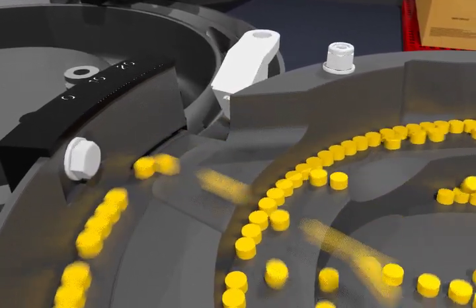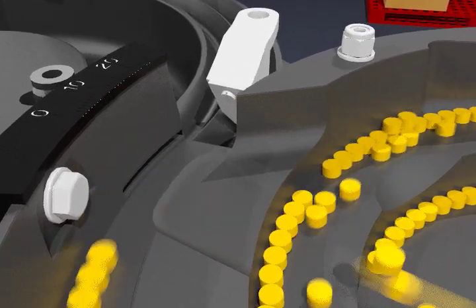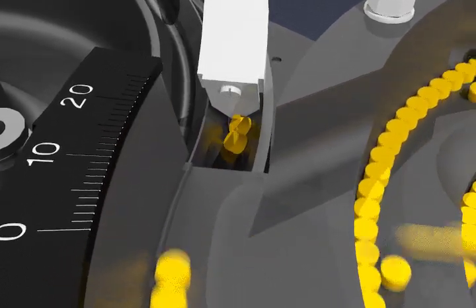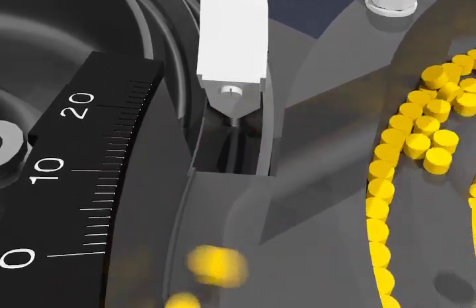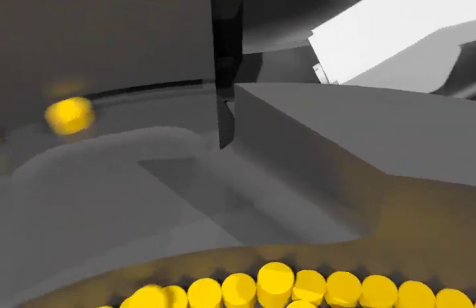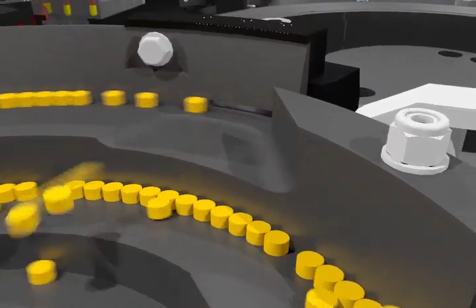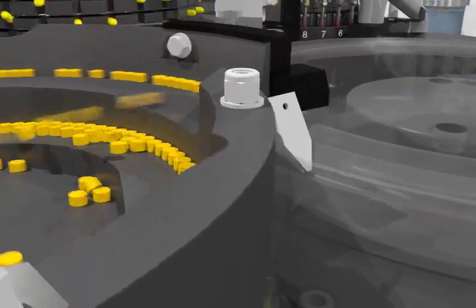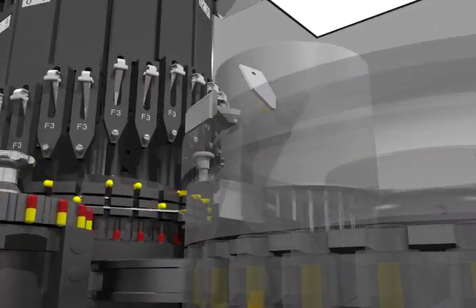As the feed drum rotates under the vibrating container tablet exit, the recirculation blower is stopped briefly to permit one or more tablets to be deposited into the continuous channel in preparation for dosing. Upon transfer of the preset number of tablets to the drum, the optically controlled blower resumes tablet recirculation. The tablet deposited into the channel is held in place by a blade as the feed drum rotates. The tablet then drops by gravity along the tablet chute and into the capsule body contained in the capsule bushing belt.